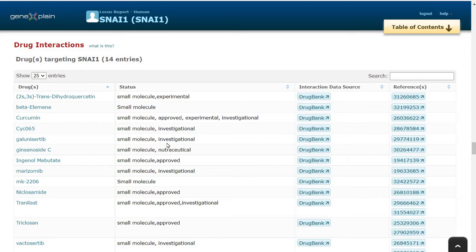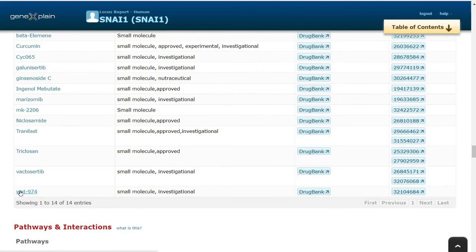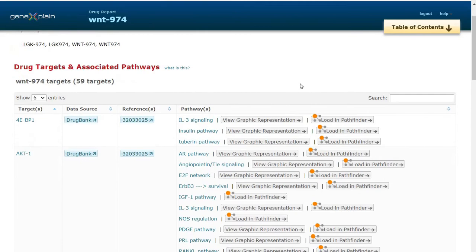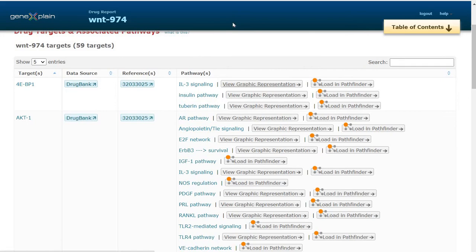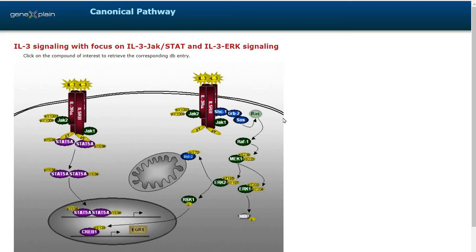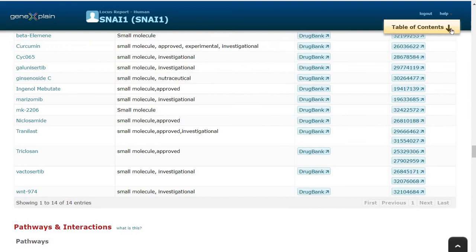SNAI1 is known to interact with several small molecules as shown here. 14 molecules with references from where this information is curated. We can open a drug molecule, say WNT974, and we can see the associated pathways and targets for this particular drug in this list. The pathways can be clicked and we can visualize the pathways within the platform from the report.